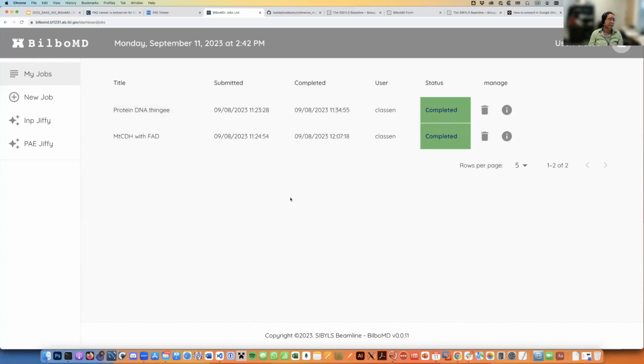Do you think that you'll implement it where somebody can put in an amino acid sequence, and then it'll go to AlphaFold 2 for prediction? I mean, we could. But I'm not sure if people would want that.